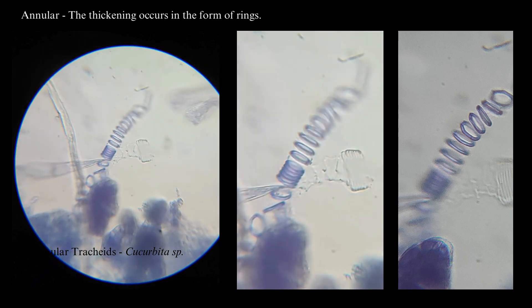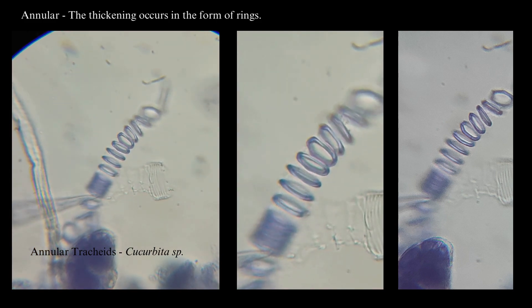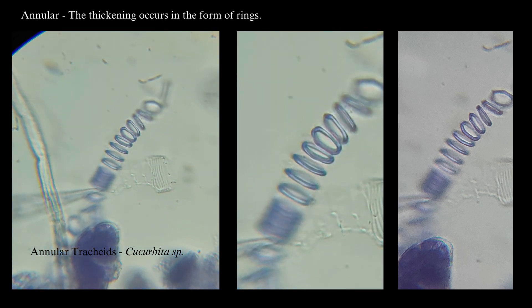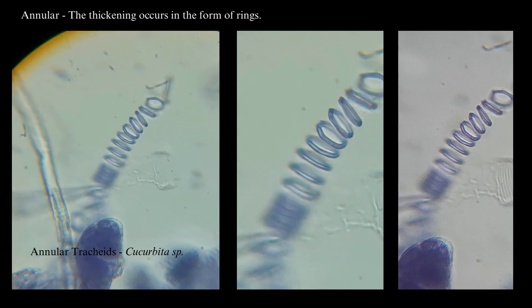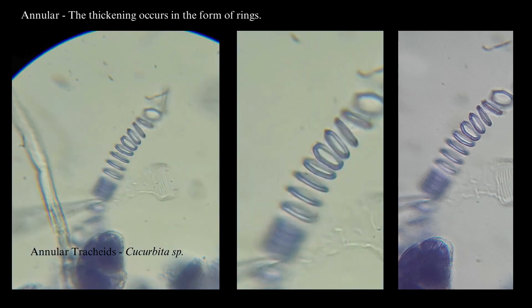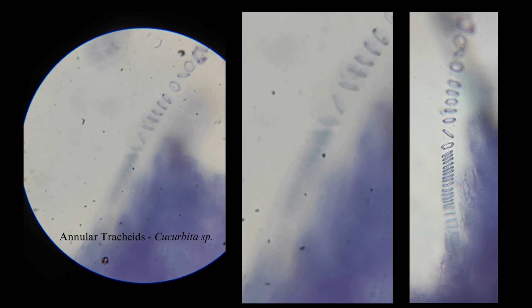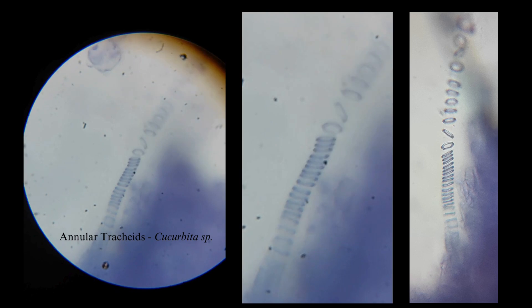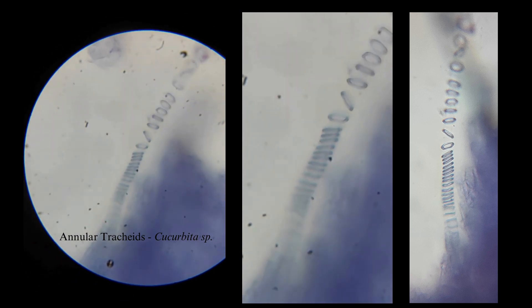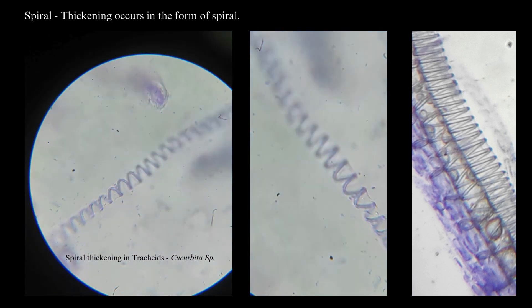Annular thickening — this thickening occurs in the form of ring-like patterns. This is the tracheary element of Cucurbita stem. Next is spiral thickening, where the thickening occurs in the form of a spiral.